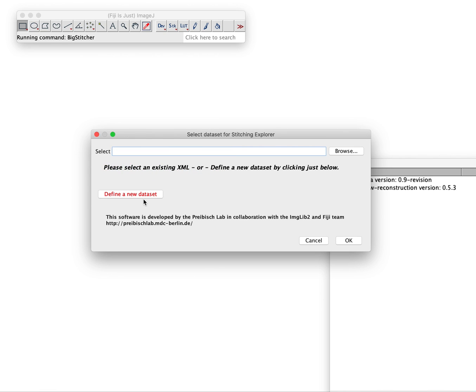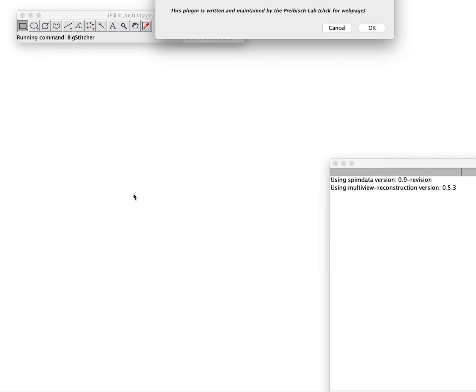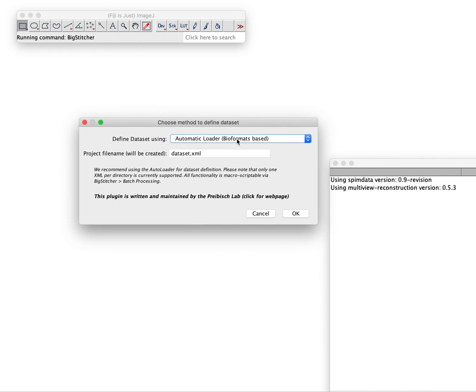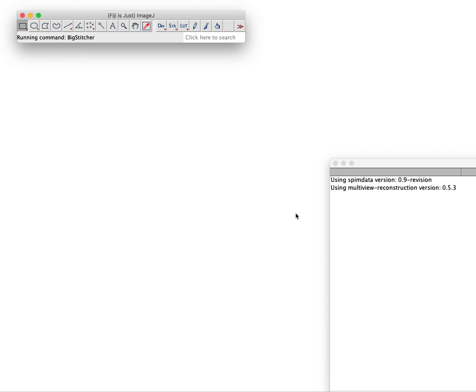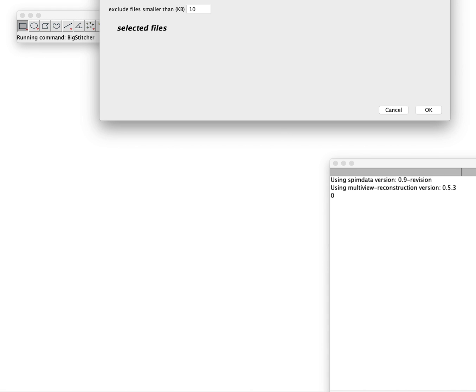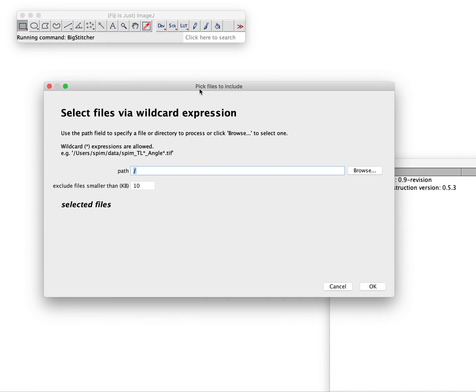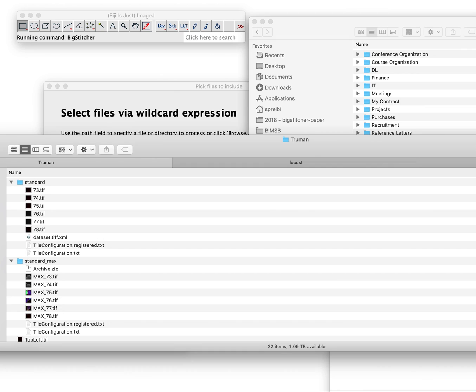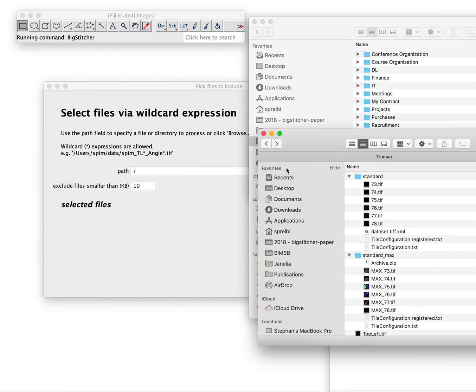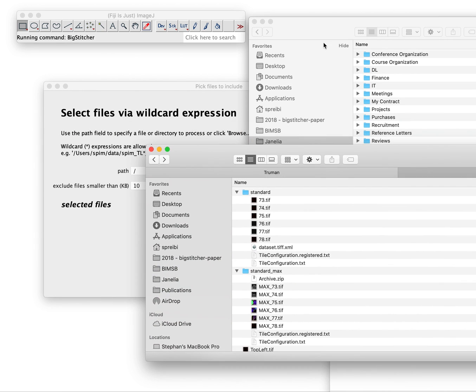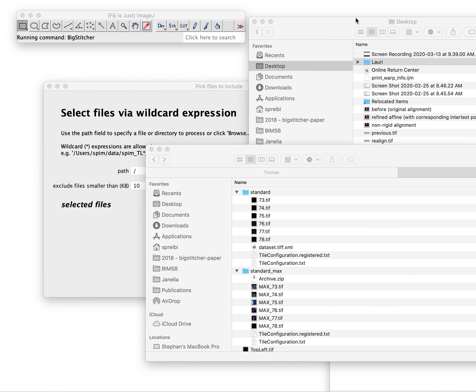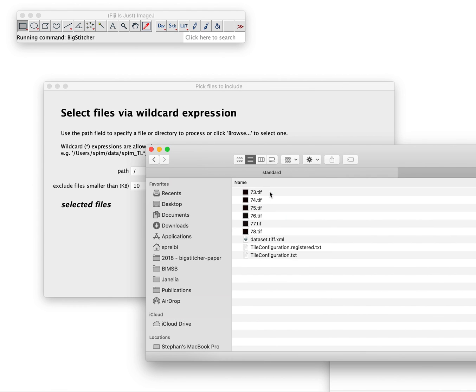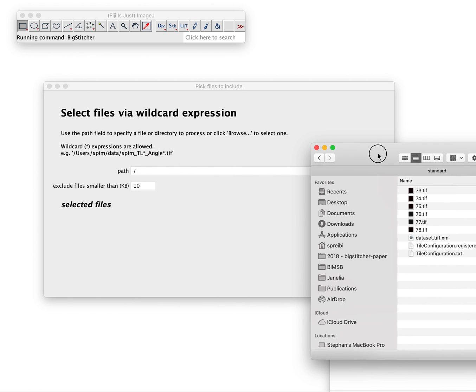Let's assume you do not have any dataset, you want to define a new one. You can use the automatic loader as you may be used to. You press OK and now it asks you for the path where you want to define your dataset that we later then resave. I have that dataset here and we go into this folder.